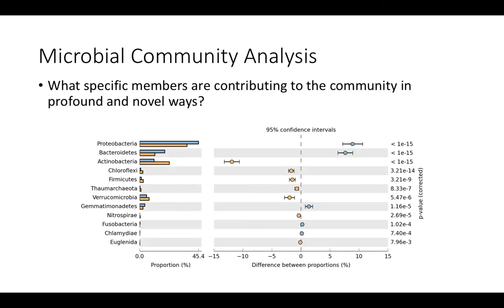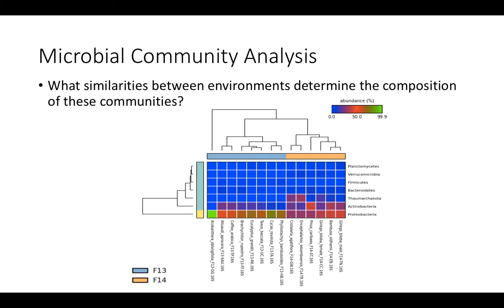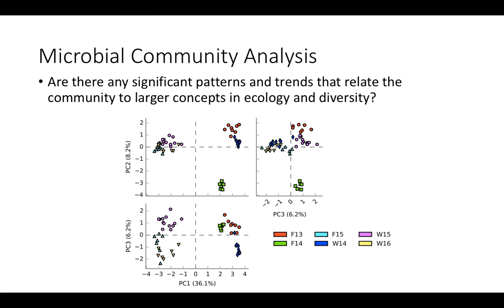Here are some examples of the plots that you can generate using STAMP. You can use an extended error bar plot to discuss what specific members are contributing to the community in profound and novel ways. You can use a heat map plot to discuss what similarities between environments determine the composition of the communities found within those environments. And you can also look at a PCA to discuss if there are any significant patterns or trends that relate the community to larger concepts in ecology and diversity.